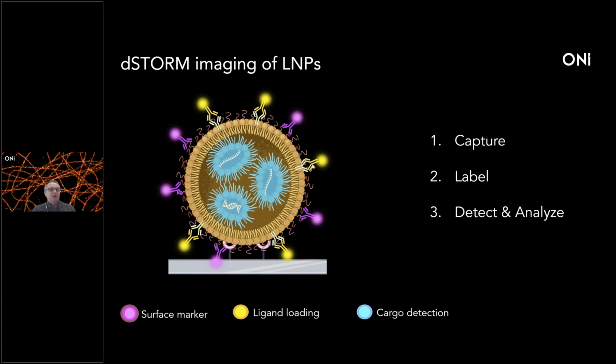And then if your particles or lipid nanoparticles are functionalized and contain a ligand on their surface, in this case, you can add an additional color, which will also give you a detection here. So you will be able to detect three different components of your lipid nanoparticles by one experiment in one single step. You will get information about your cargo detection, about your sizing, and about your ligand positivity, whether your particles contain a ligand and how much of it.